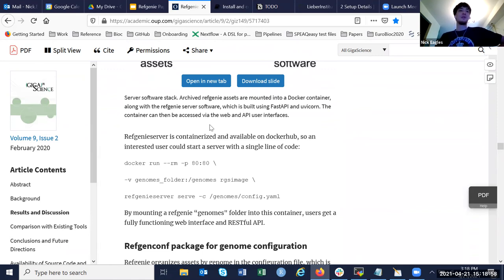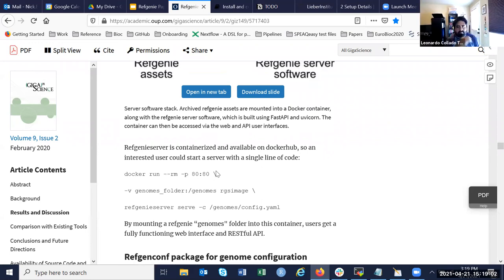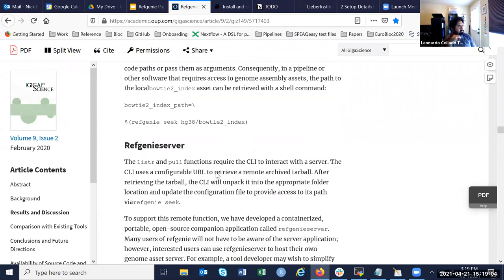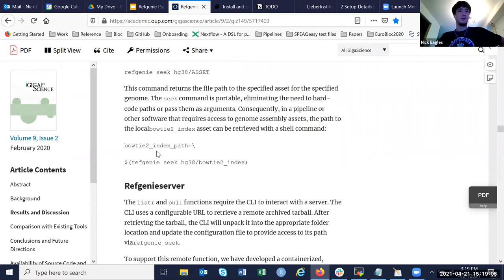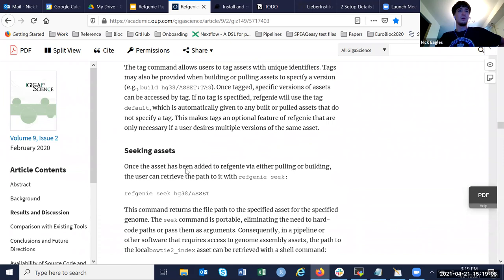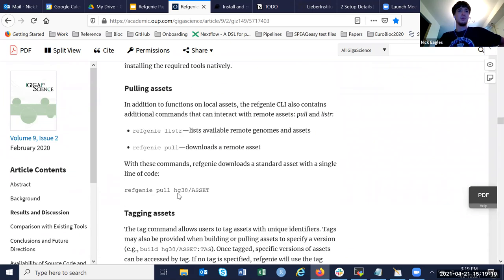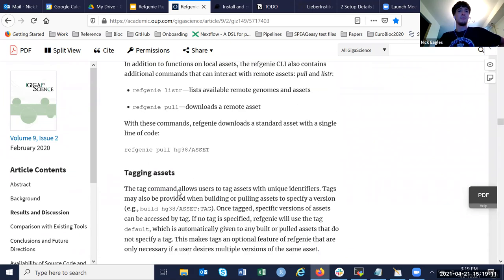You can host your own server pretty easily, although I don't know if we would ever need to do that. We went over 'listr,' 'pull,' 'seek,' and I briefly covered 'build.'